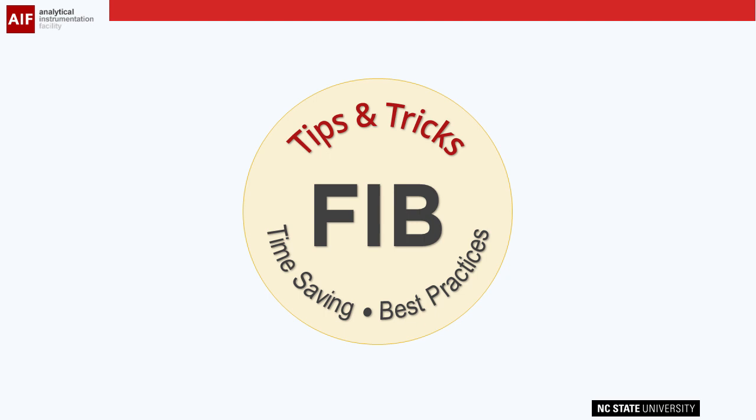This video is designed for the intermediate level user. So this is for someone who has already trained, has been able to make successful TEM samples, and really wants to learn how to do it a little bit faster and a little bit more efficiently. So I don't recommend this for new users or people who have not used the FIB before.